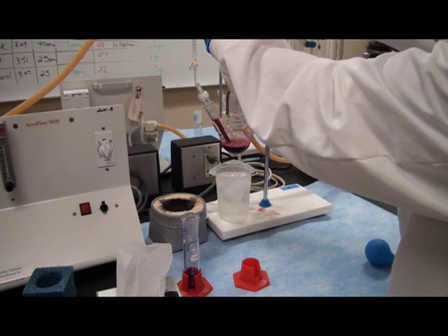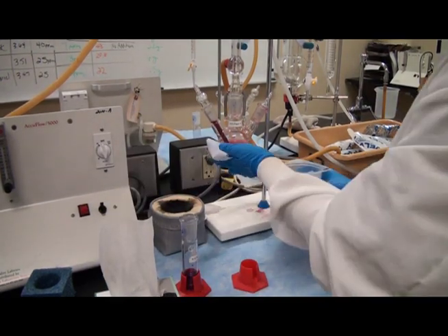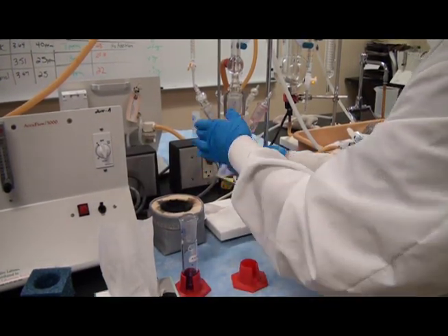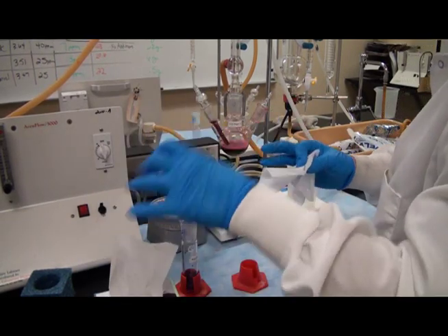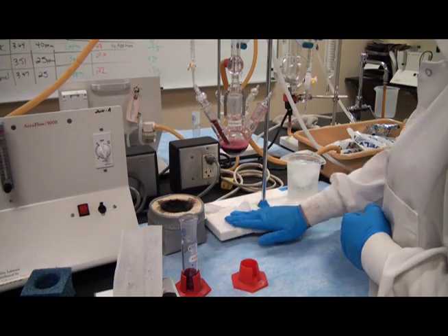In order to obtain a total SO2 value, a bound SO2 value is needed in addition to the free SO2 value just obtained. Using the same sample already in the round bottom flask, assemble the apparatus.